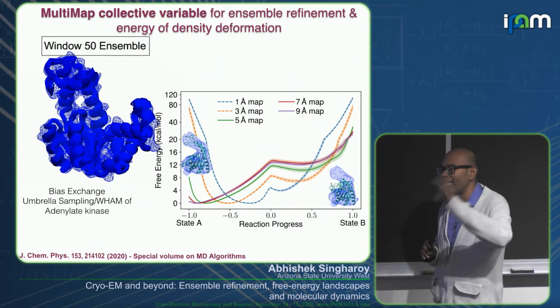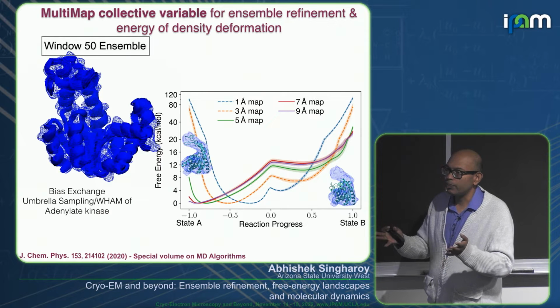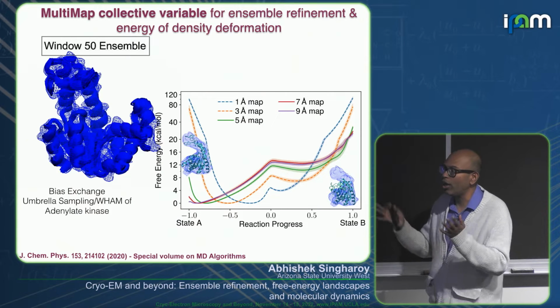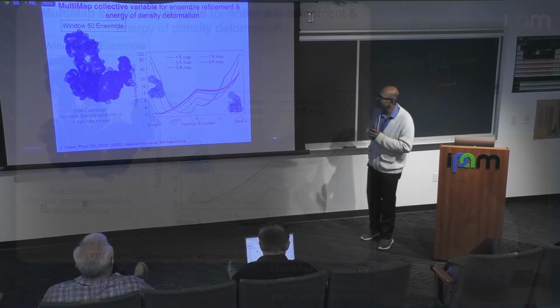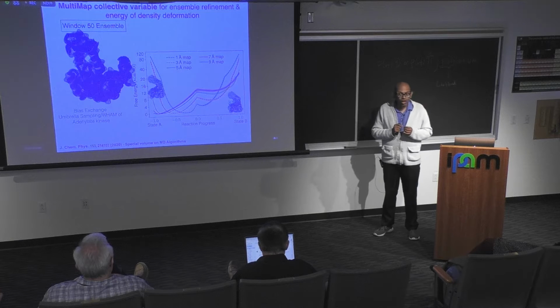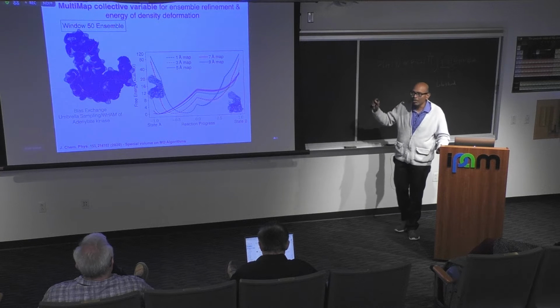We converted this entire problem from a fitting problem into a problem of creating a harmonic force field out of the density. So that's the first thing. Any questions? These are simple things. I'll get into a little more complicated things.